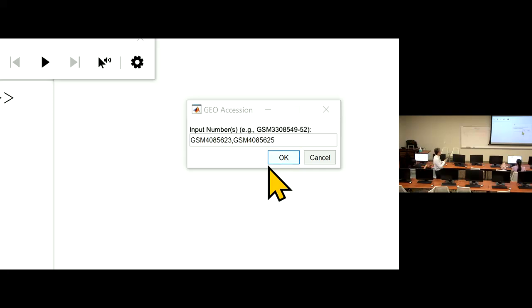If you have this, you can click OK and let it download and merge the data together. This way you don't have to do it independently, one by one. Just let the program run it. Yeah, go to the latest version.